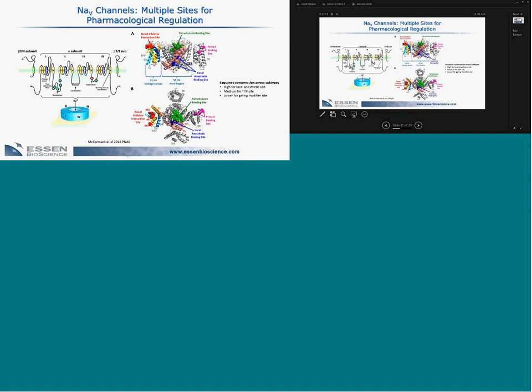One of the things that's come up recently as people started to develop subtype selective compounds is that now, in addition to subtype selectivity, you get species differences. And that's not really all that surprising because these are variable domains and they vary across subtypes and they're going to vary across species. So we've started to develop rodent-specific sodium channel cell lines, and I'm showing you an example now from a rat NaV1.8 cell line. And that's important because most of the efficacy models are done in rodents. So you really want to know whether the compound works on the rodent channel before studying in vivo pharmacology in rodents.